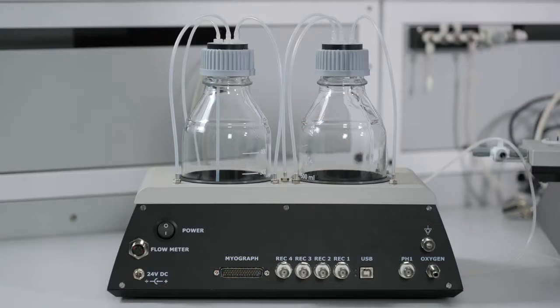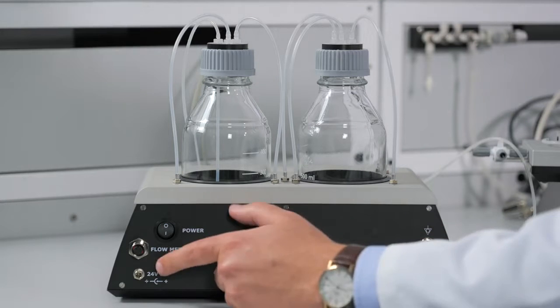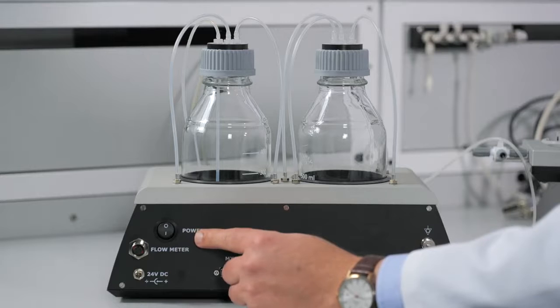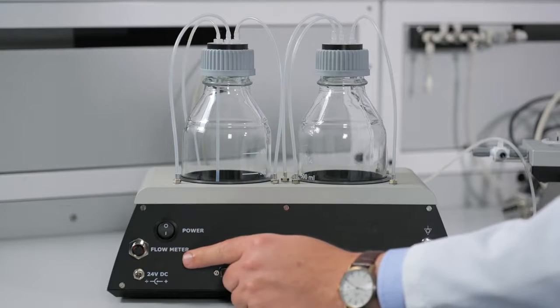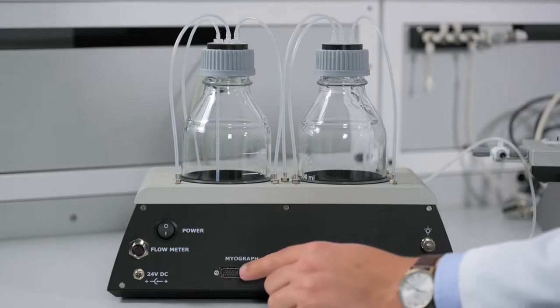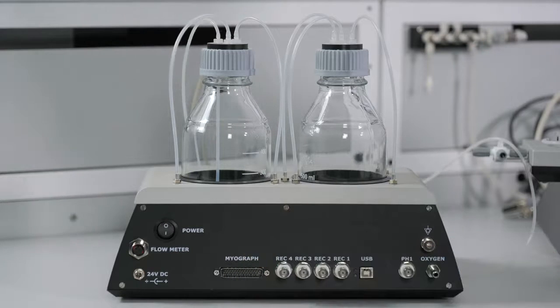The connections on the back of the interface will allow you to fully utilize the system. There is a connection for the power source and a power switch. There's a connection for the flow meter to accurately measure the flow through your chamber, and a connection for the MyoGraph cable that will go to your chamber and allow it to communicate back and forth.